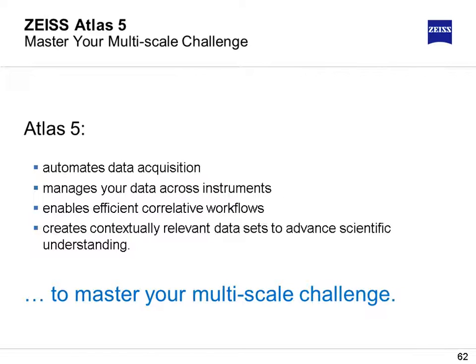Question for you, Paul, from a Dr. Shearing at Medtronic. And he asks, he says in one of the slides you showed an image of the cathode and obtained cathode porosity. Now, how do you get porosity from an image, and does the instrument include software to calculate that porosity?